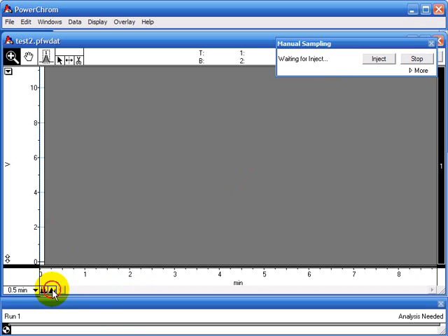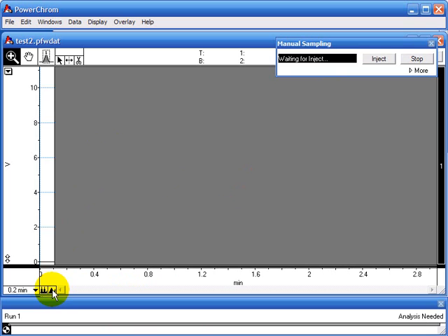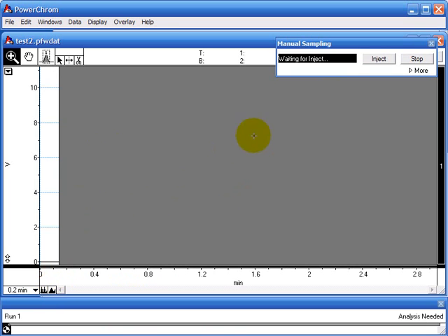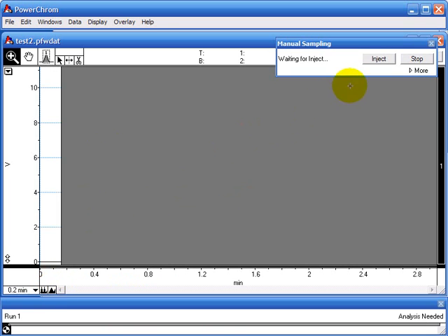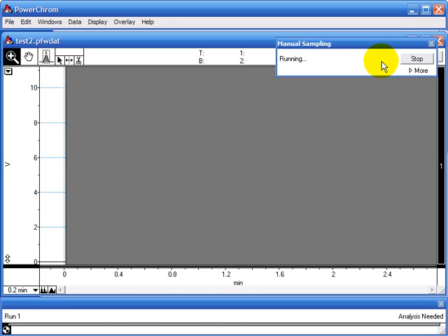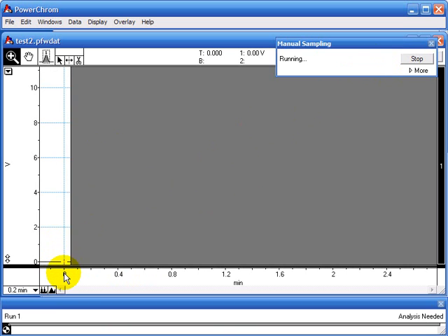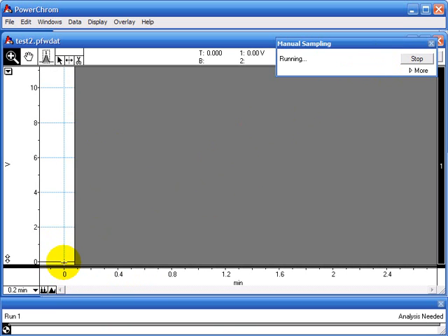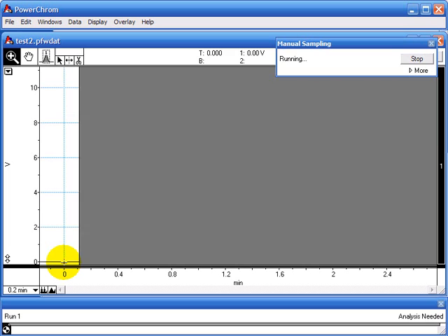I'm going to open up the x-axis a bit. When you're ready to inject your sample you click inject and the software has moved time to 0 here. And I can now collect some data.